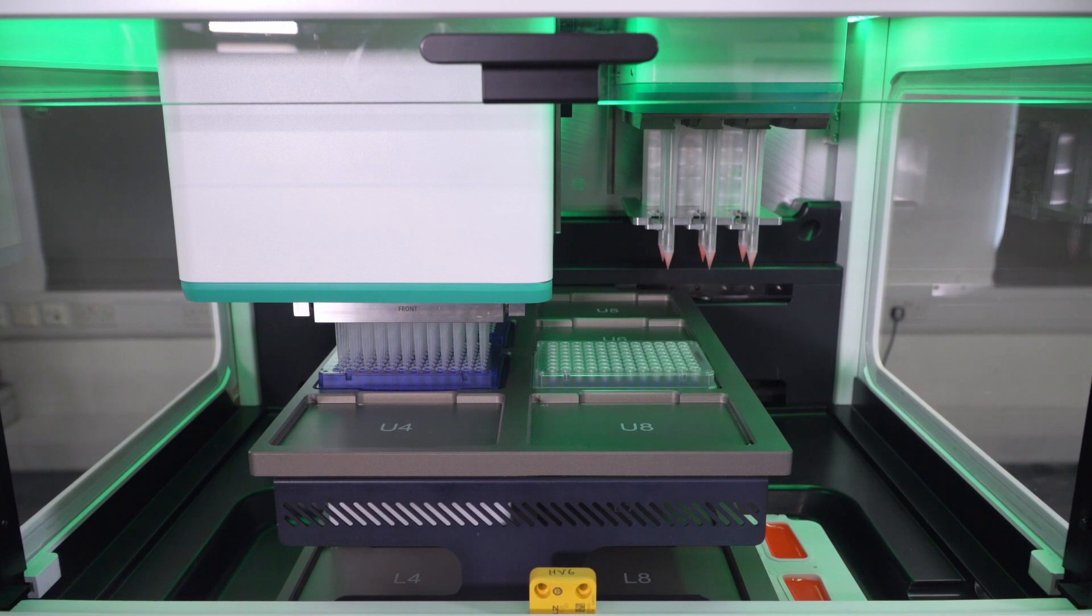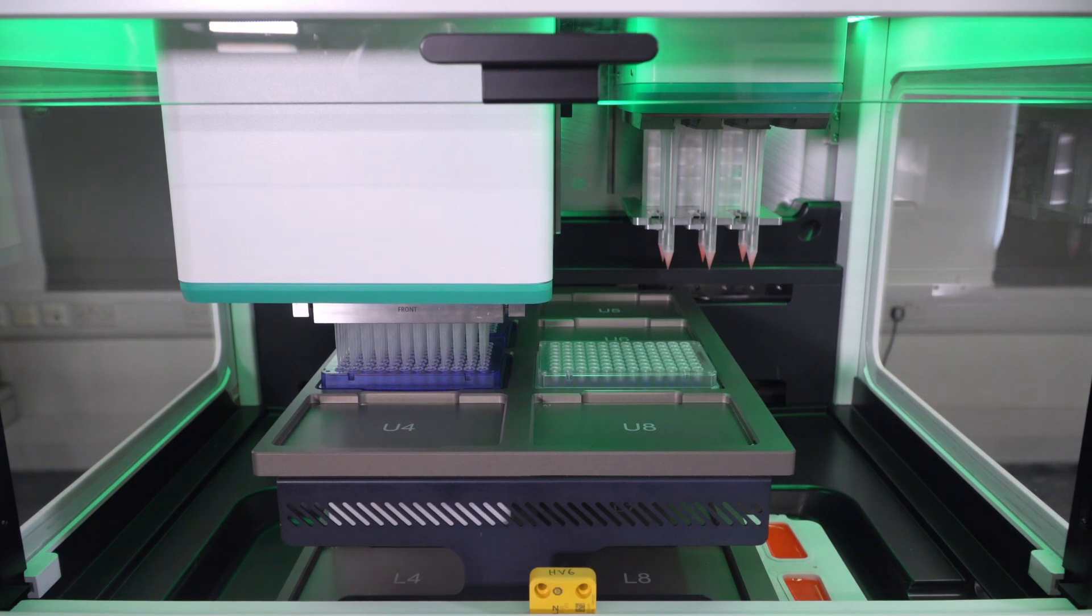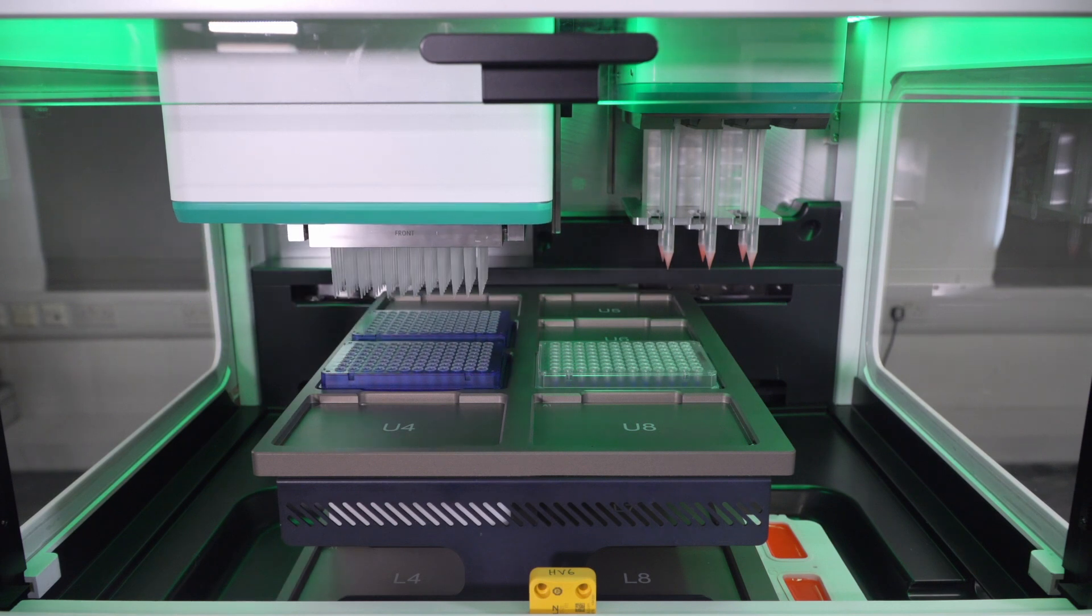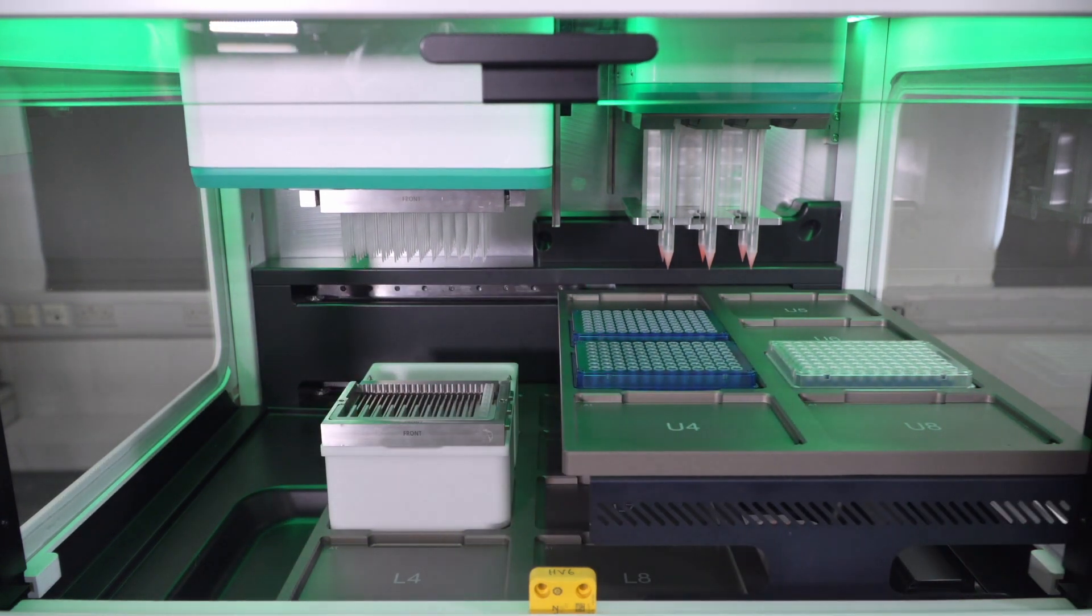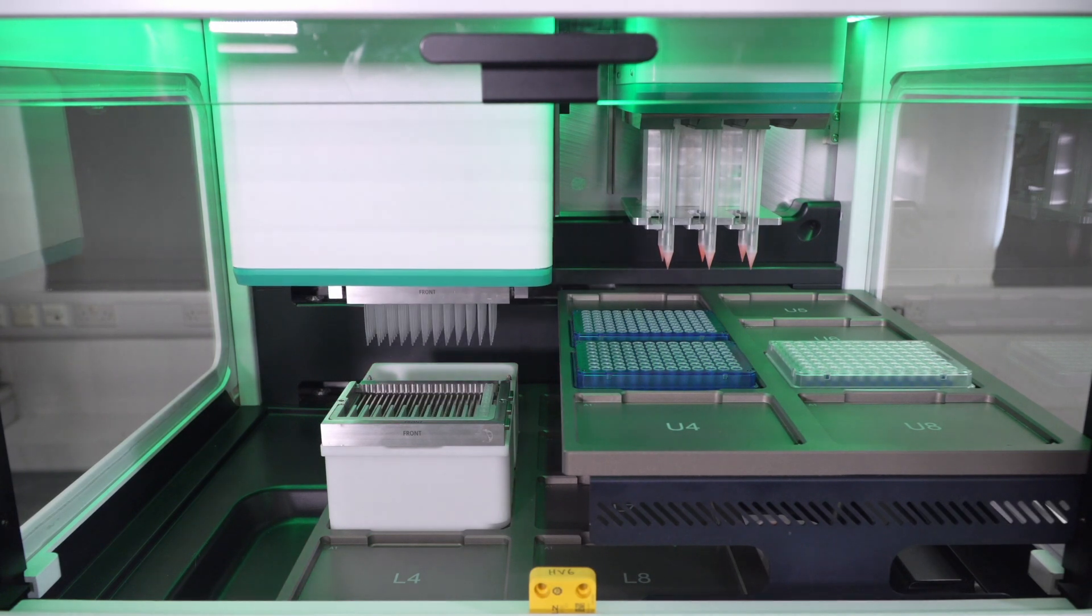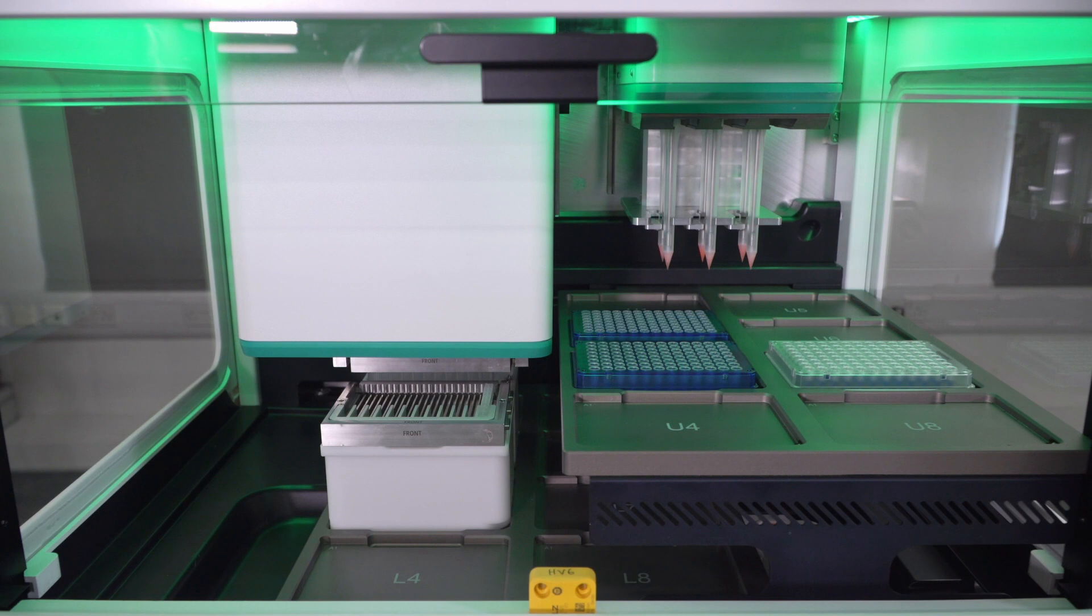And we're performing a left-right tip touch, and a front-back tip touch, to ensure that all the liquid got moved, and there's no liquid remaining in the tips. Now we're going to unload the array of 96 tips.